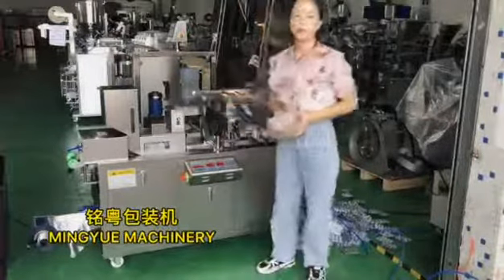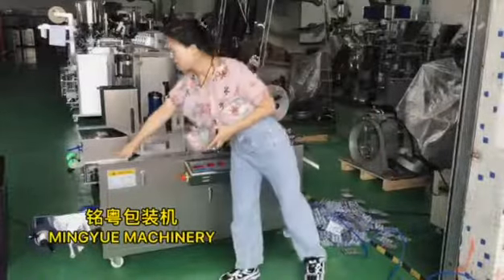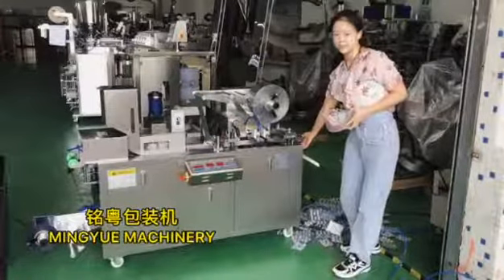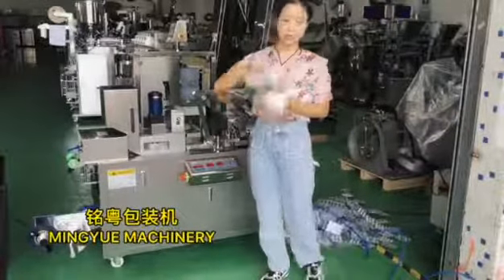If you want to have different cans, different size products, you need to change three parts. The first part is the PVC forming mold. The second part is the aluminum foil sealant mold. The last part is the cutter. So you can change this side, this side, and this side.